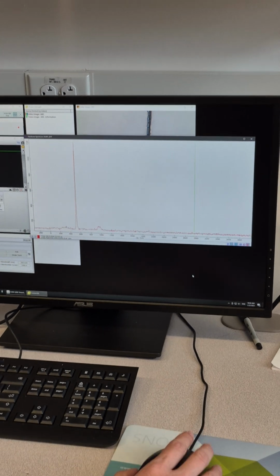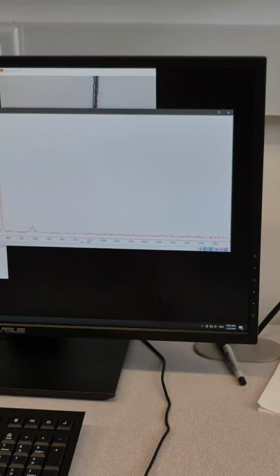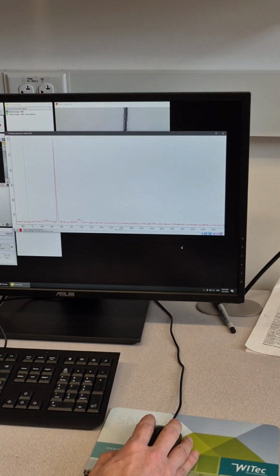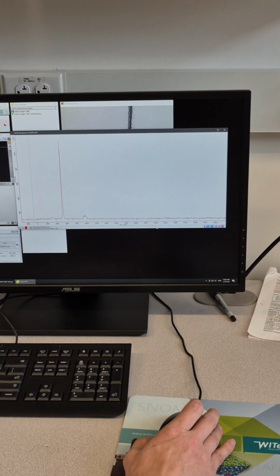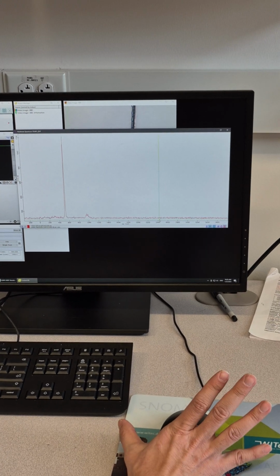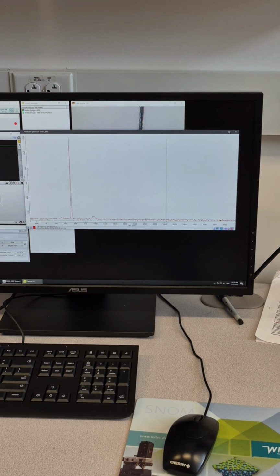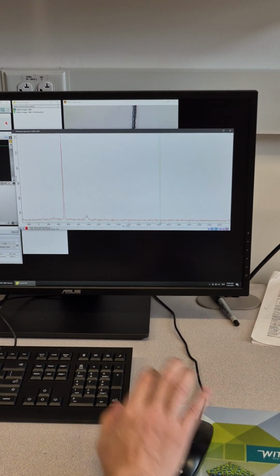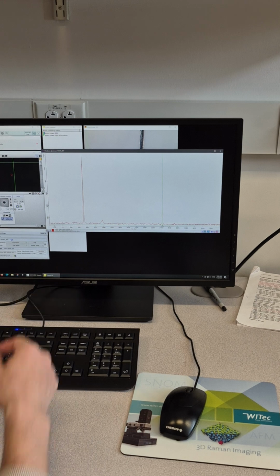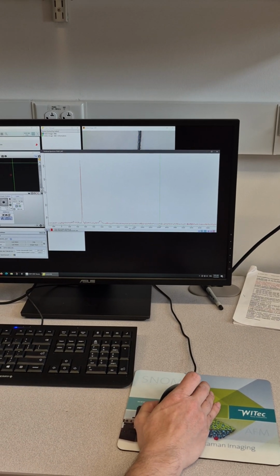And auto scale X means it will use the whole 4,000 range to show it. But if you move your mouse into the spectrum and stop somewhere and use the center wheel to roll it, it will use the current Y position at the center to manually scale your sample, right?